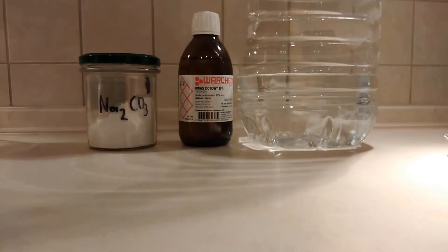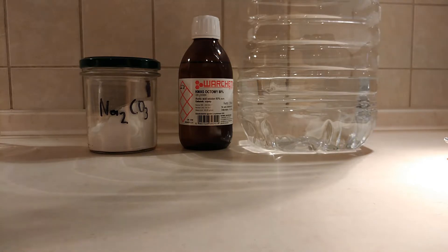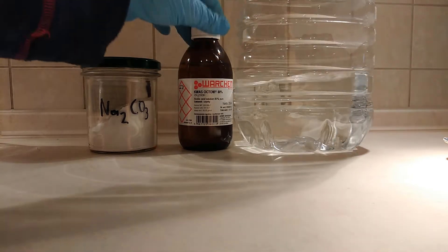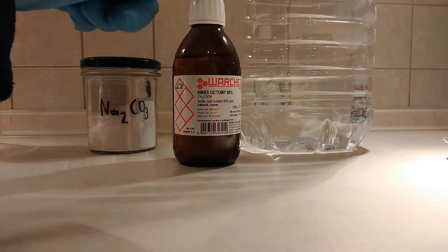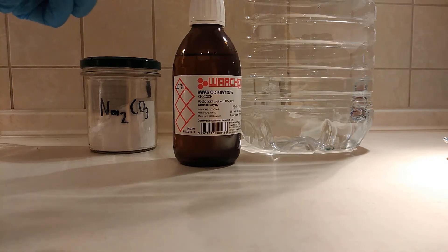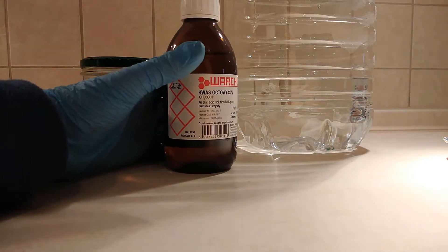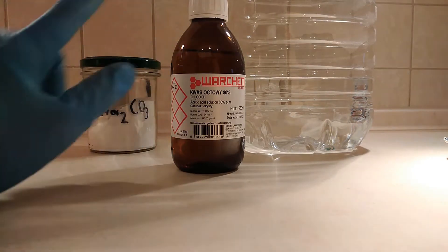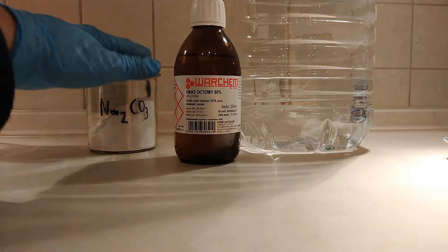In this video, we're gonna be making sodium acetate. Sodium acetate is a really useful building block in organic chemistry, and for this preparation we're gonna need three things: distilled water, acetic acid. Vinegar can be used here, but vinegar is too dilute, so the yield will be a lot lower if you use vinegar, which is 5% acetic acid instead of like 80% acetic acid or glacial acetic acid.